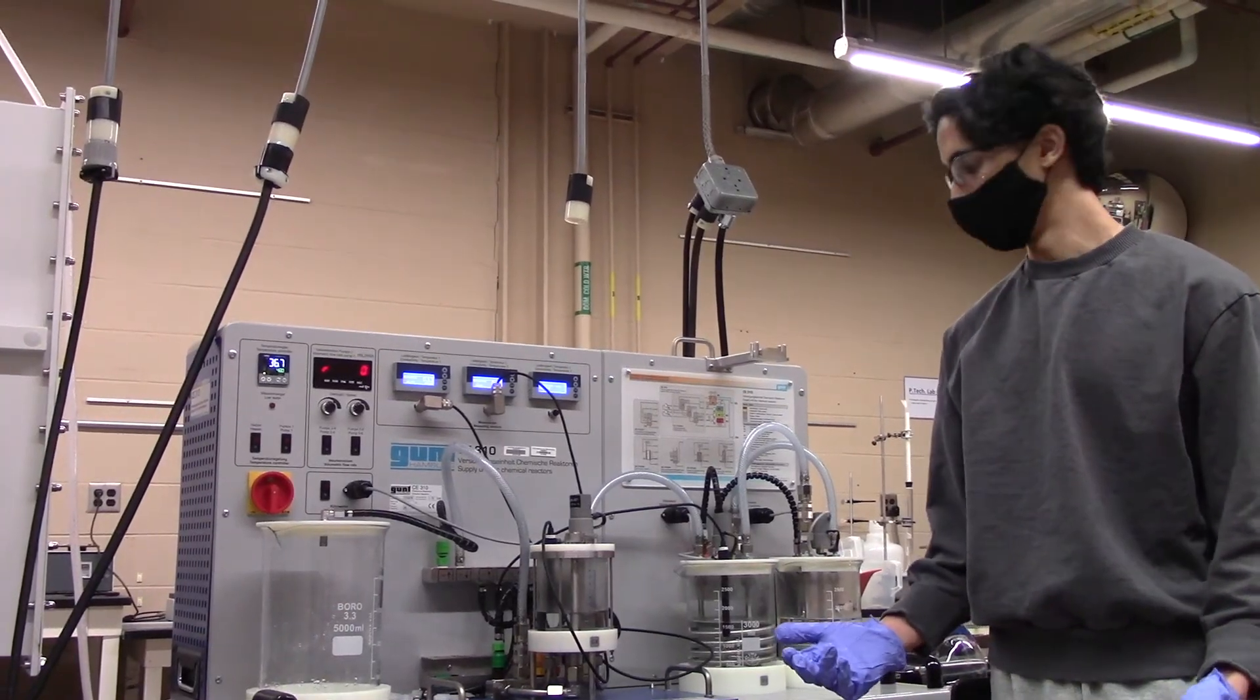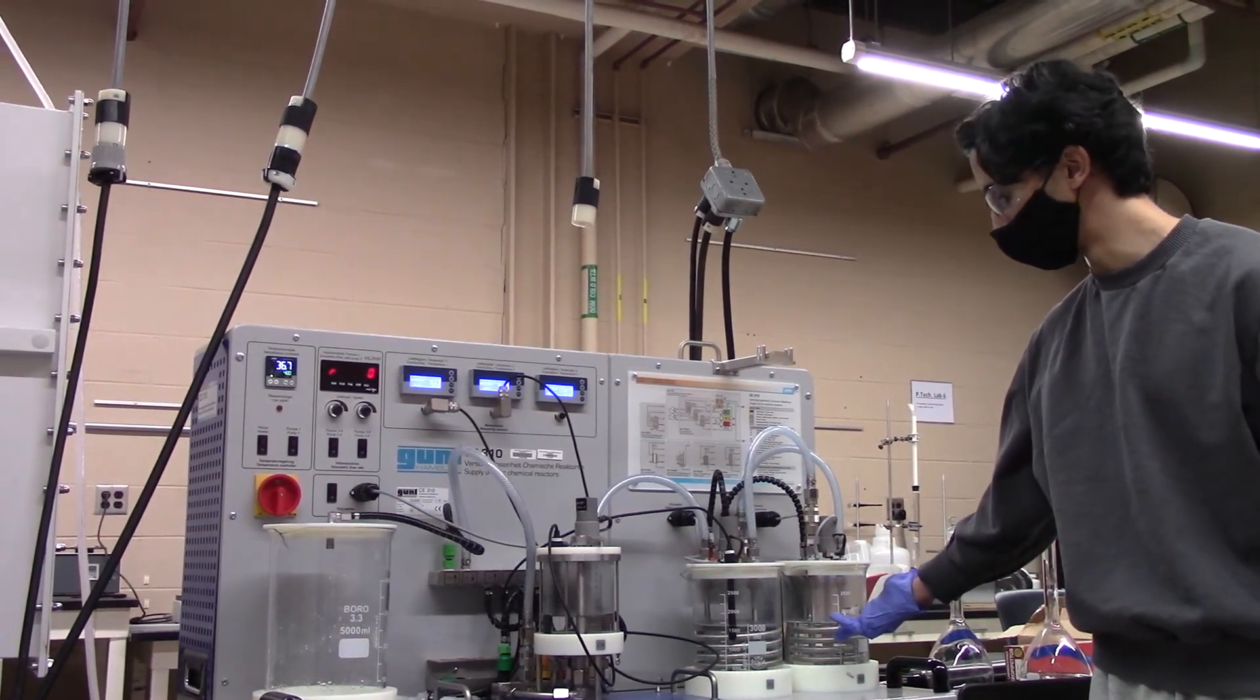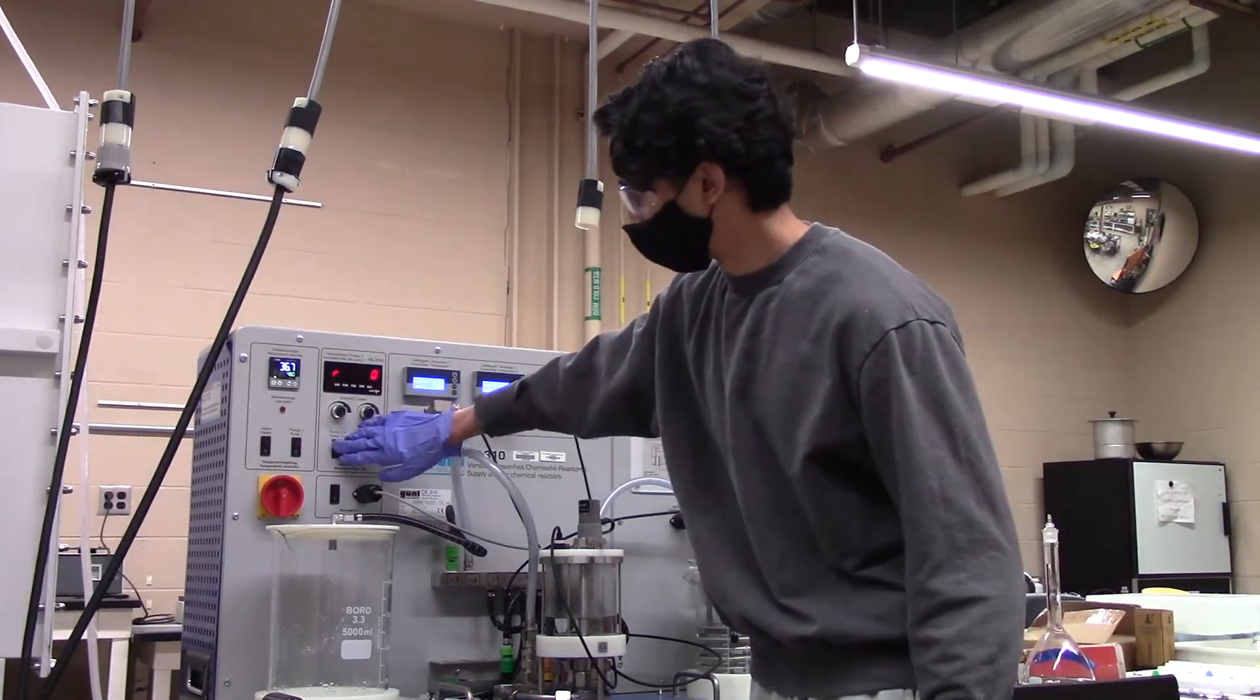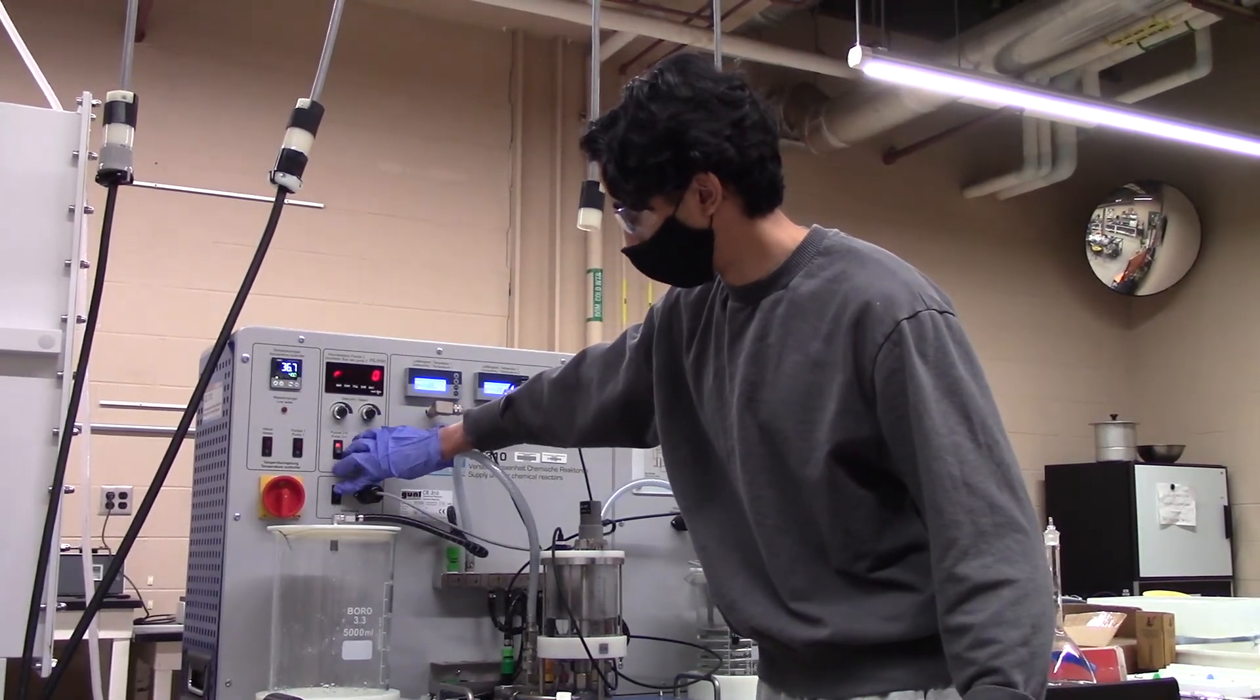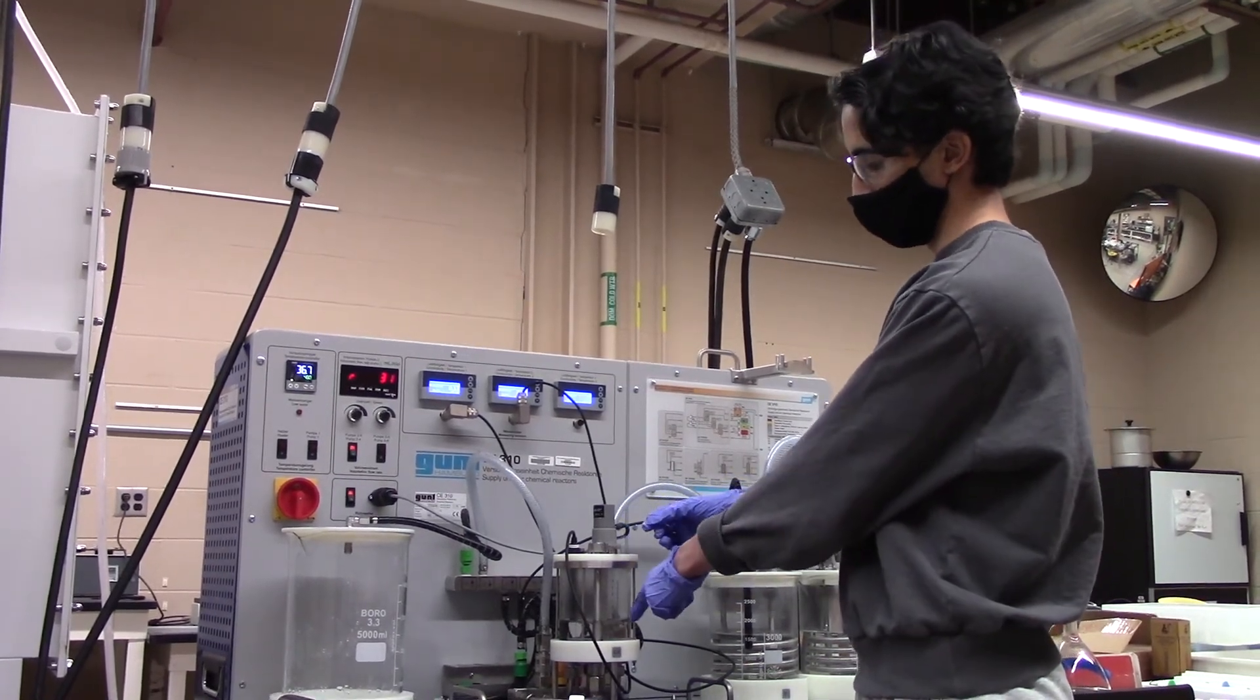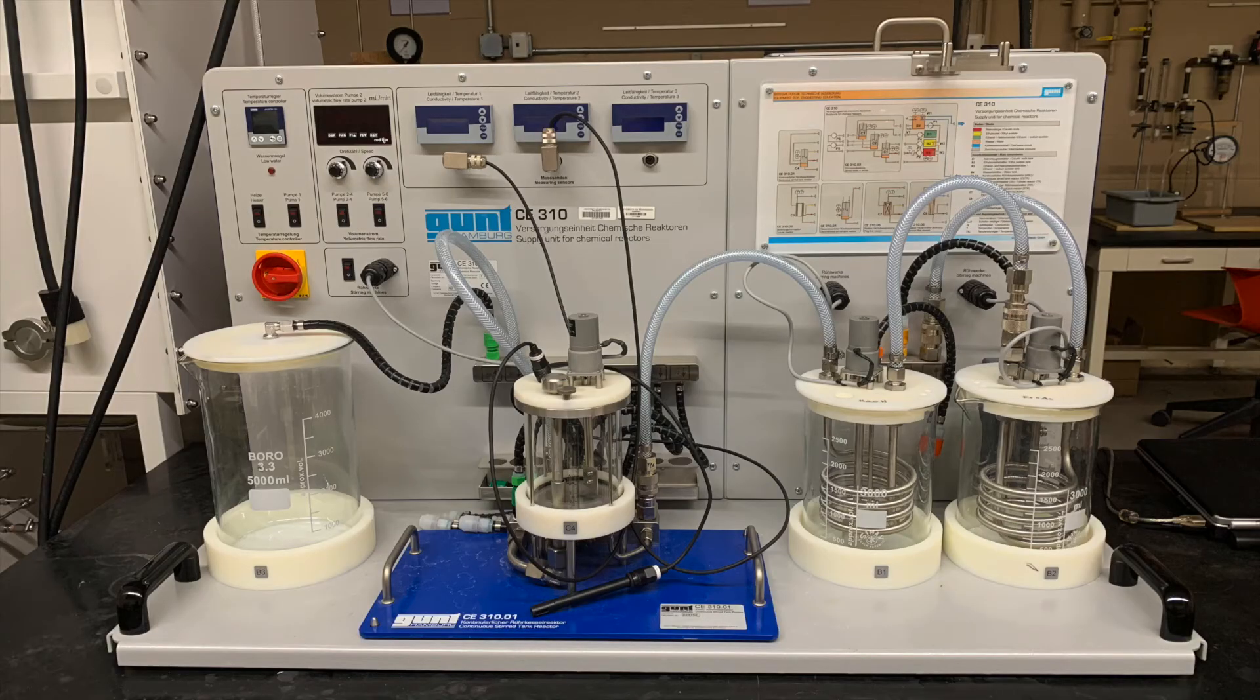Finally, in order to rinse out the CSTR, fill both reactant beakers with water and turn on pumps 2-4 and the stirrer to run the water through the system. Similar to before, pipet out any remaining liquid in the system. This water can be disposed down the drain. Make sure to clean up the lab station before leaving.